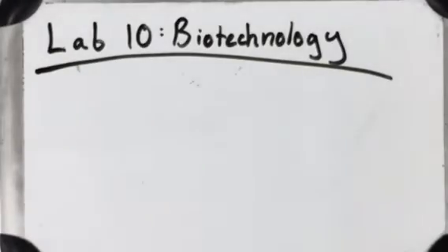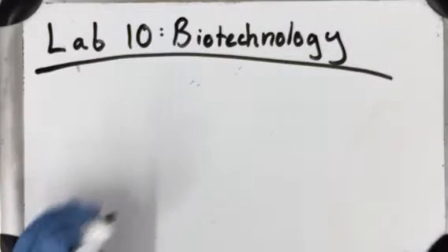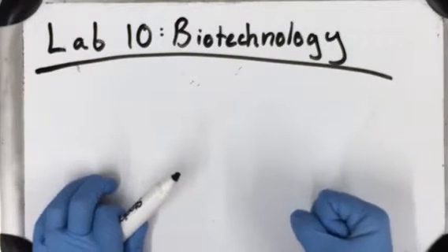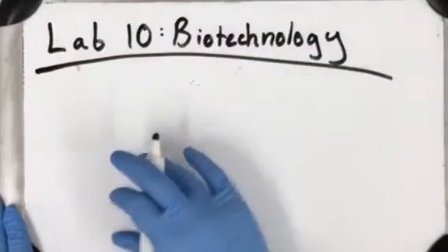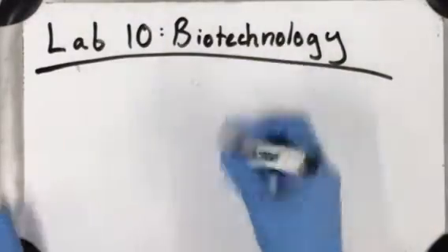Okay, so today's video is going to preview exactly what we're going to do in Lab 10. And that's essentially just in 3 steps. We're going to isolate DNA from bacteria clumps, those little plasmids, and then we're going to cut those with restriction enzymes, and then we're going to run them on a gel. And the TAs will do that last step for the most part. You'll load the gel, but they'll set up the images and everything.